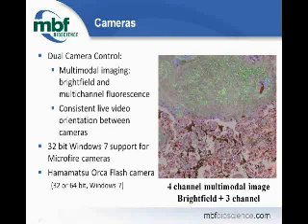One of the issues we've had in the past with dual cameras is that on one camera port you may have a bright field camera and the other one might be the fluorescent monochrome camera, and one or the other is flipped. On the fly now, in version 10, we will flip the desired camera to make a consistent live video orientation between the 2 different cameras. That way you don't have to have that mental context switch, so that when you switch between cameras, things will be lined up even better.